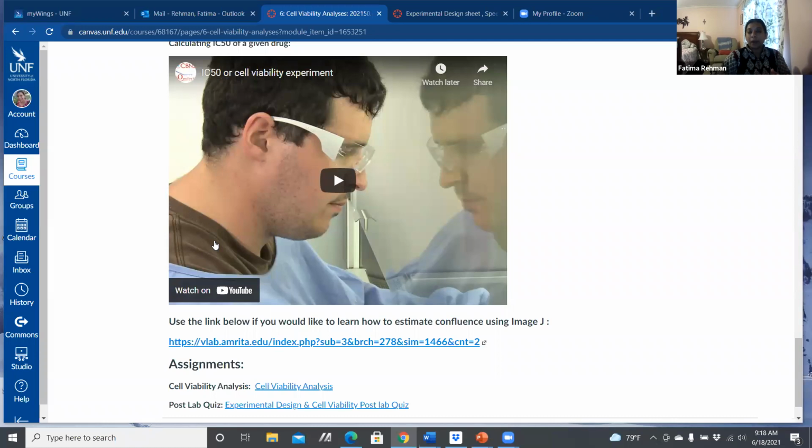Then we observe them over time, and we calculate at what concentration 50% of the cells die at a given time point, and that's considered the IC50. This particular video is going to walk you through how we would set up that experiment, how we would make those observations, and how we would interpret the actual graph at the end of the day.